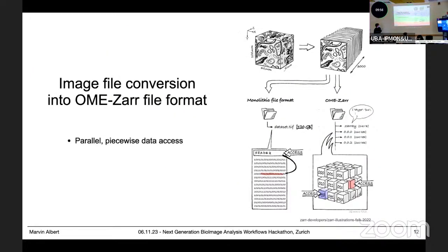The first thing that we do, especially when the data is very large, is to convert the images into a different file format. These are considerations more on the software side, but you need to convert your files. If you look at input TIFF files, for example, they show you the data all in one large chunk. But if you want to visualize your large images, you would want file formats that allow you access to individual blocks of the data so that you can visualize these more efficiently. So this would be a first step that we would perform.